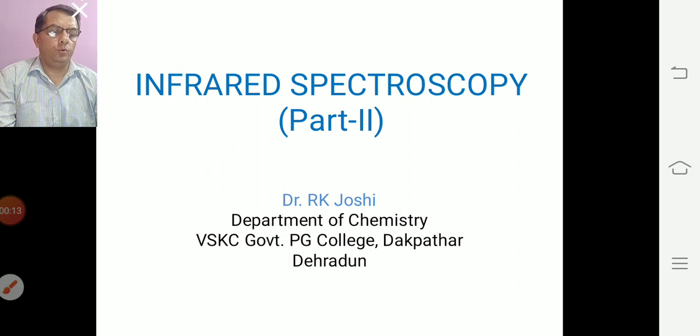As you know, infrared spectroscopy can be used to distinguish one compound from another. No two molecules of different structure will have exactly the same natural frequency of vibration. Each will have a unique infrared absorption spectrum.